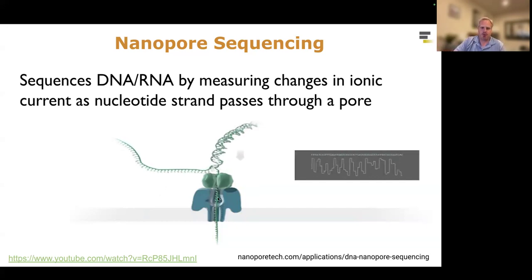The protein pore, the nanopore here, is actually going to be taller than 1 nucleotide. Commonly, in the case of R9 chemistry, maybe 6 nucleotides will be in there. In the case of R10 chemistry, you're going to be reading about 9 or 10 nucleotides. In fact, there's even larger context that will subtly alter the current. So you don't get a one-to-one readout of 1 nucleotide to 1 current readout. Instead, what you get is a whole k-mer, and you observe a current measure from that.